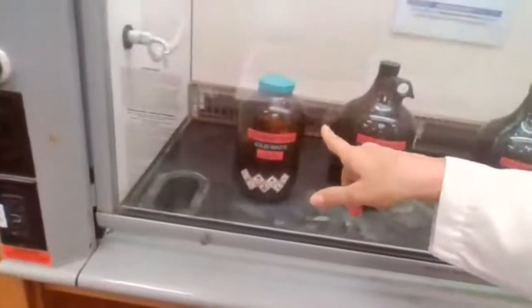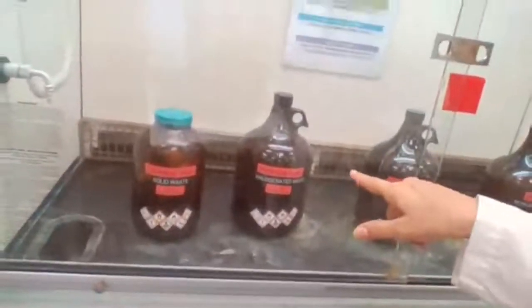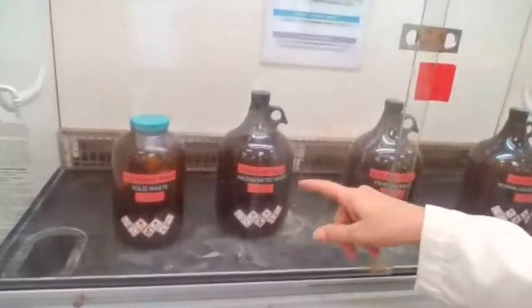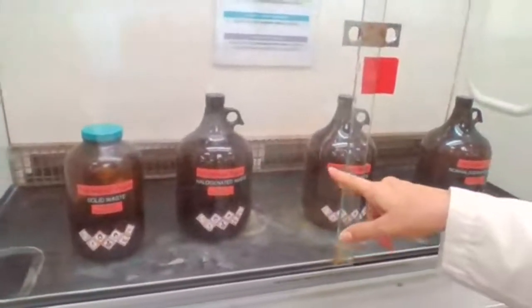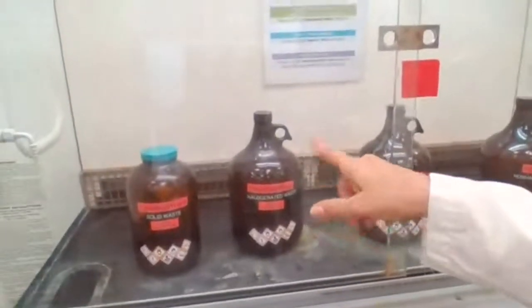We have hazardous waste for solid waste, and halogenated, so that means it's an organic compound, but it doesn't have chlorine, bromine, or iodine. I'm sorry, halogenated would be the ones that contain chlorine, bromine, or iodine.